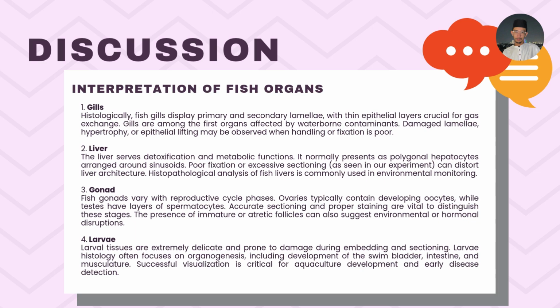Next, liver. The liver serves detoxification and metabolic functions. It normally presents as polygonal hepatocytes arranged around sinusoids. Poor fixation or excessive sectioning, as seen in our experiment, can distort liver architecture. Histopathological analysis of fish livers is commonly used in environmental monitoring.